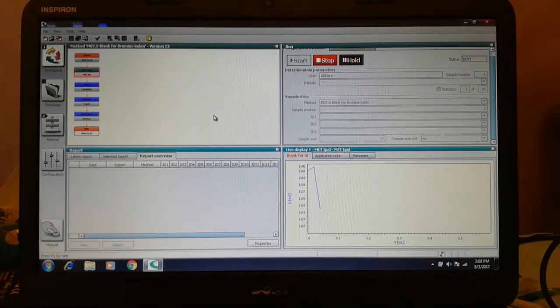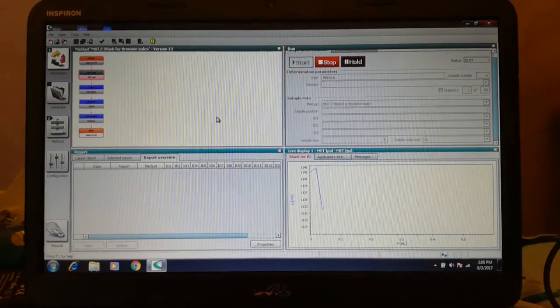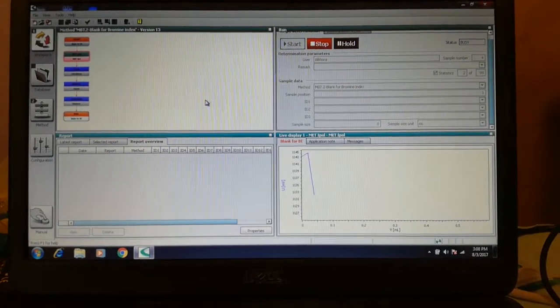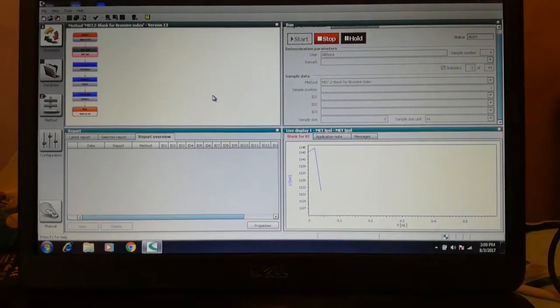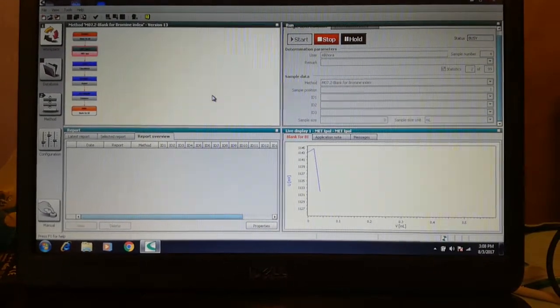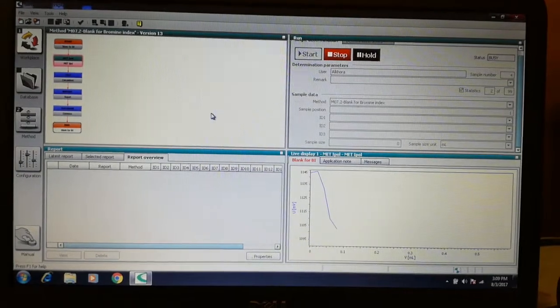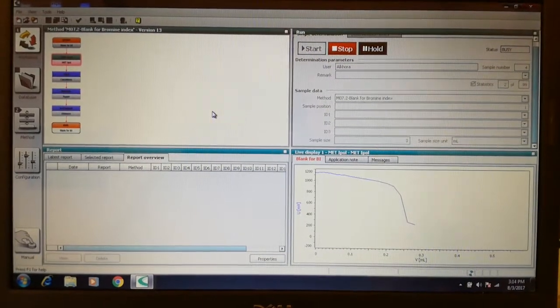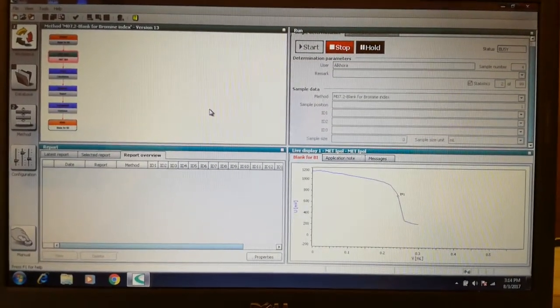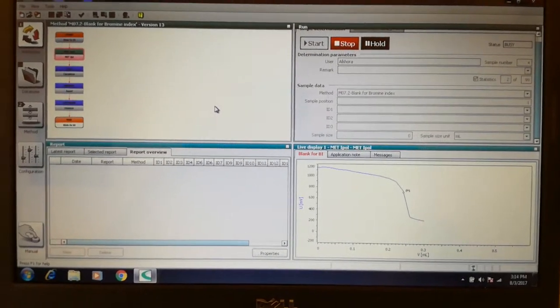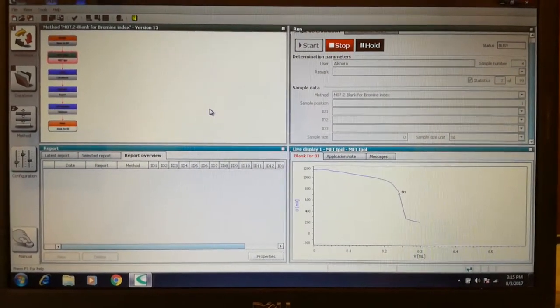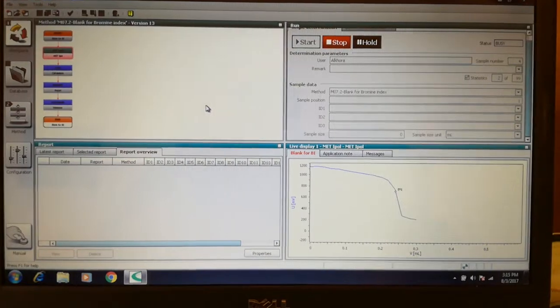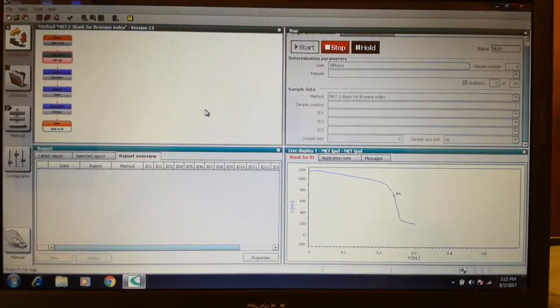The graph has started now. We shall wait for the graph to finish. You can see here we get an endpoint for the blank, which will be saved automatically in the system and will be deducted from the value of the sample later.